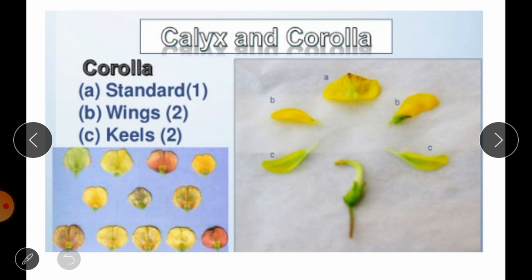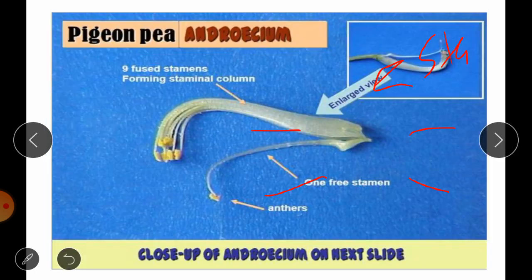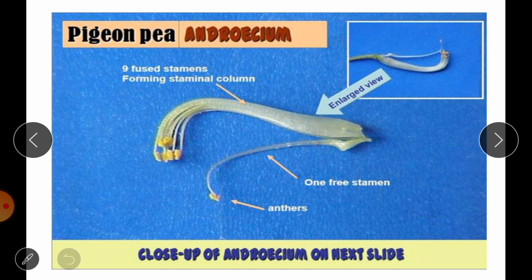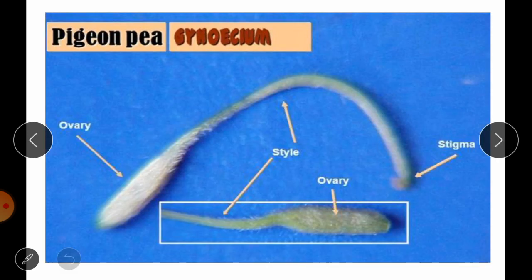The corolla can be observed in various colours from yellow to orange or sometimes pink. There is one standard, two wings and two keels. In the androecium, you can see the 9+1 diadelphous condition — nine filaments are fused together while anthers are free, and one stamen is completely free from the others. In the gynoecium, we have the ovary, style and stigma.